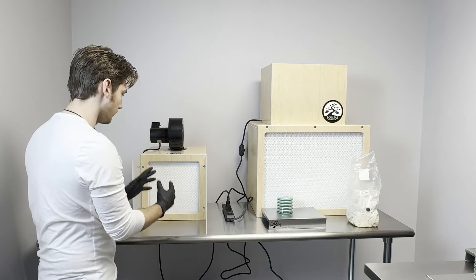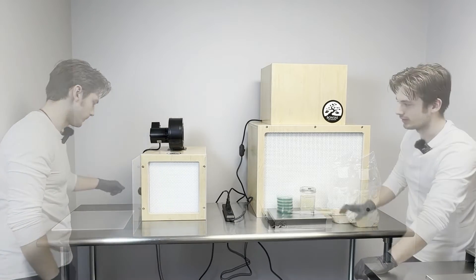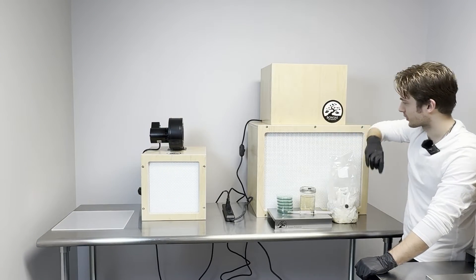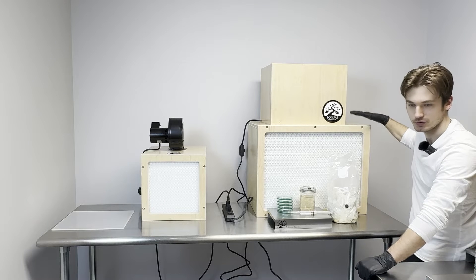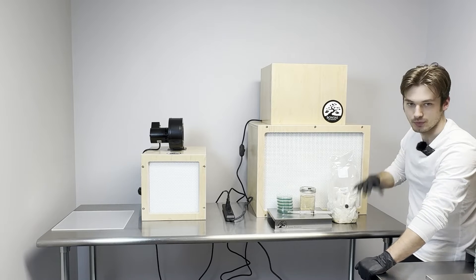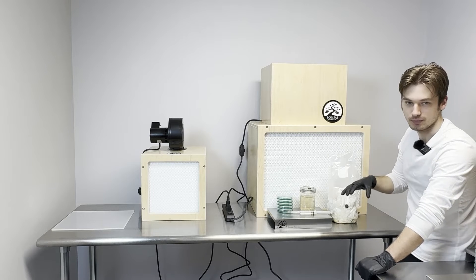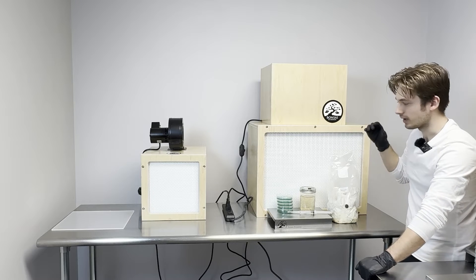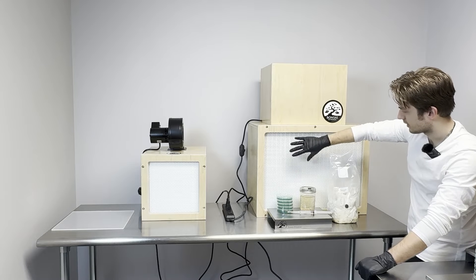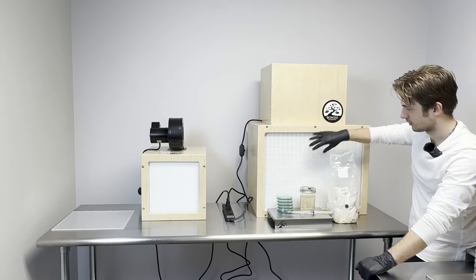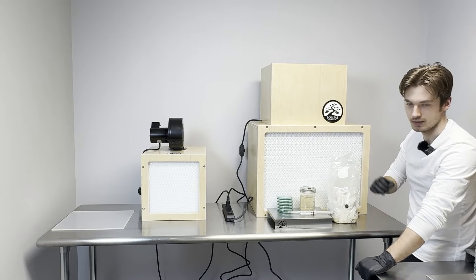This is your Bonsai HEPA flow 12 and this is your Bonsai XL 24 by 18. So both of these units are made with three quarter inch plywood, both professionally CNC machined, and furthermore the filters are both replaceable.